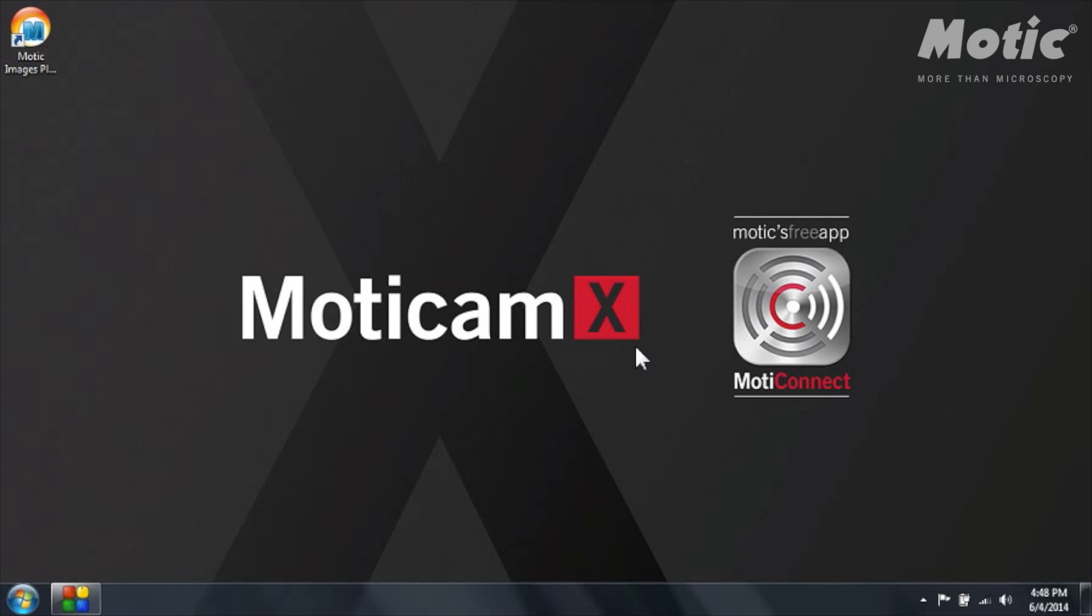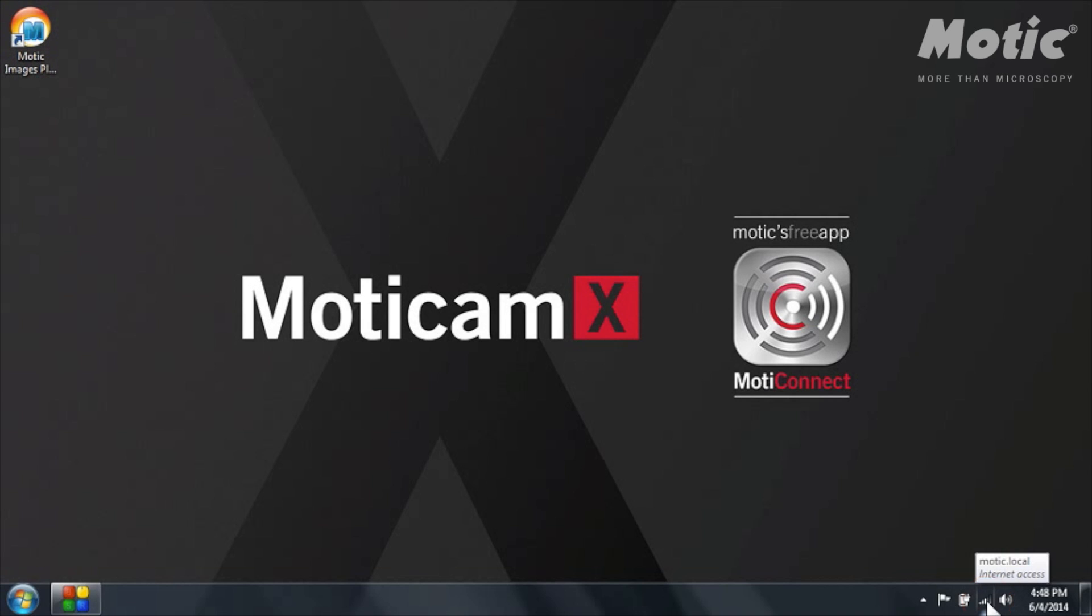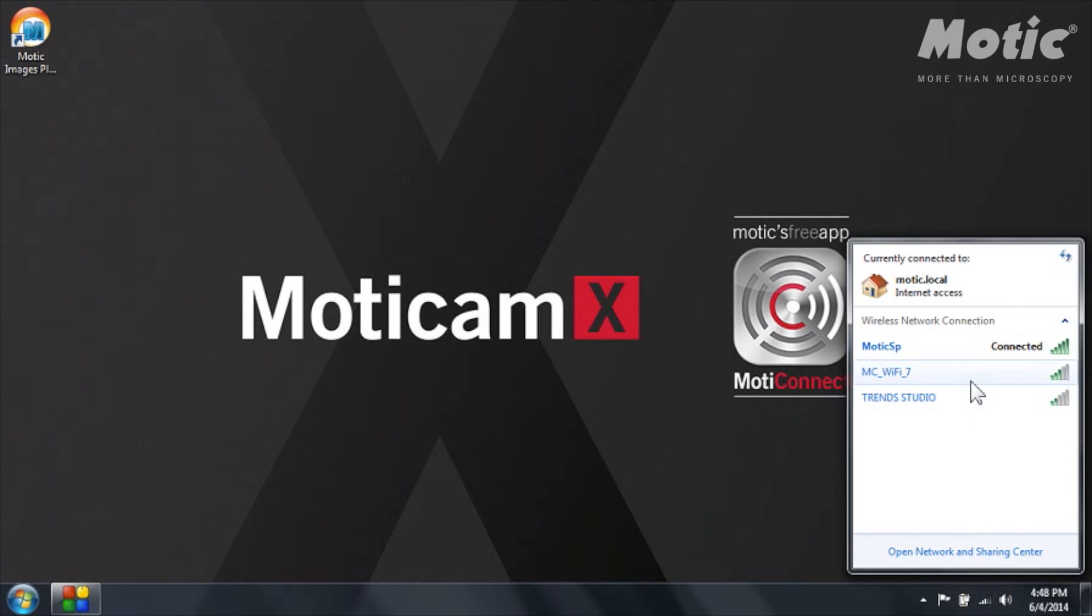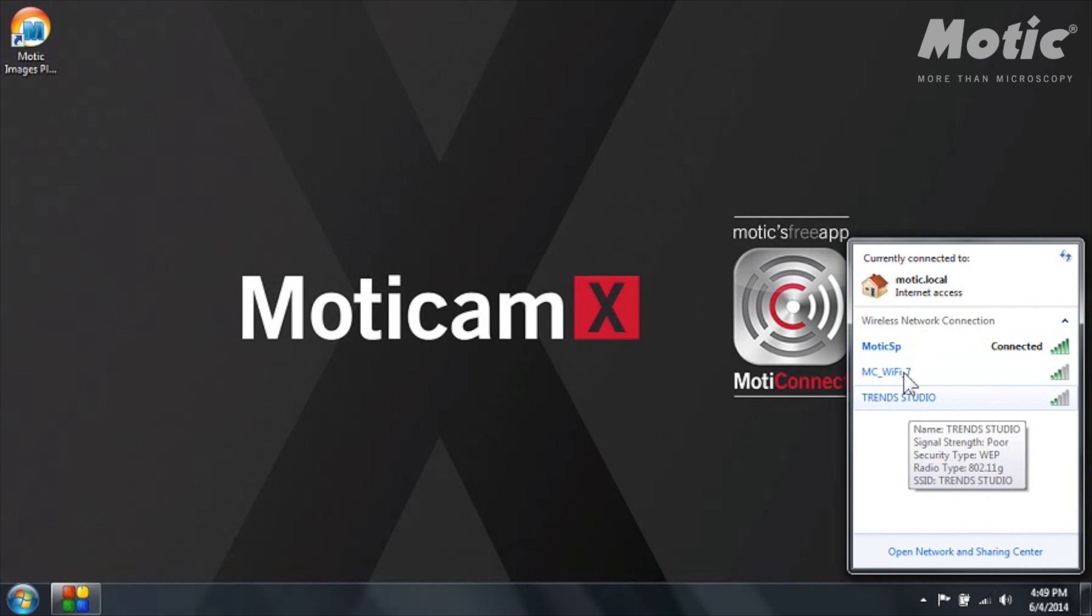Of course the router needs to be activated and if the router is activated you should see on the toolbar of your computer this icon which is the icon of the Wi-Fi connection. When you click on it you will see that there is a window with the list of Wi-Fi signals in your area.